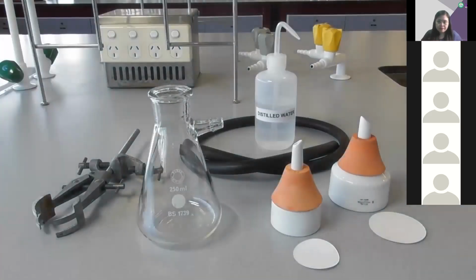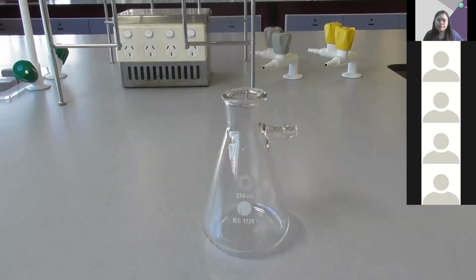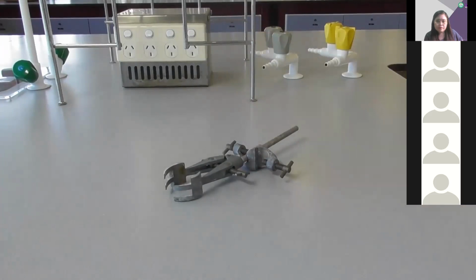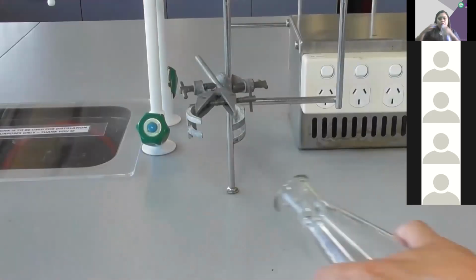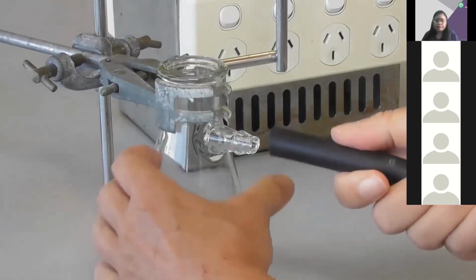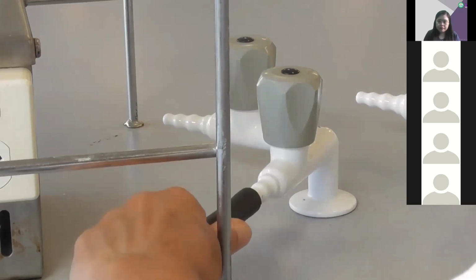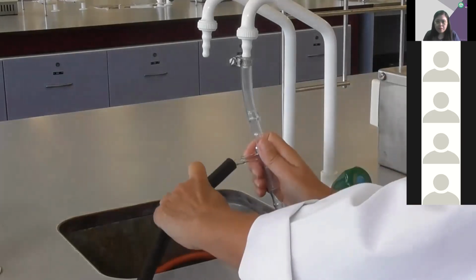Here's the equipment you'll need to carry out this filtration. This is a Büchner flask, sometimes called a vacuum flask. You will also need a clamp and vacuum hose, which usually has thick walls and is not very flexible. Securely clamp the flask to the workbench or a retort stand. Connect the vacuum hose to the short tube on the flask. Connect the other end of the hose to a vacuum source, which will generally be a vacuum tap or an aspirator.